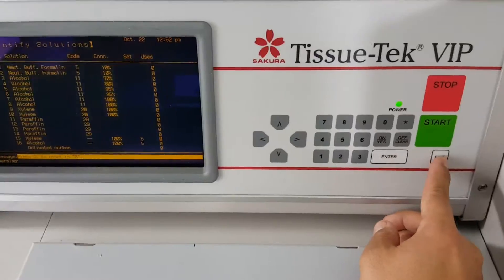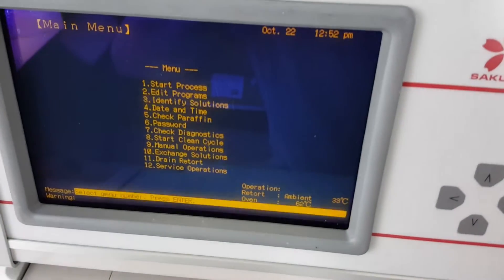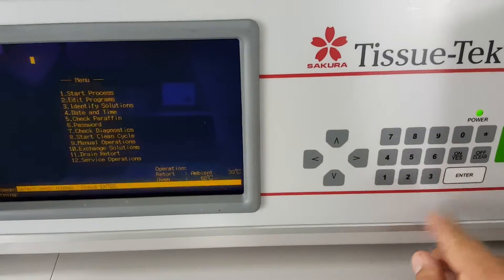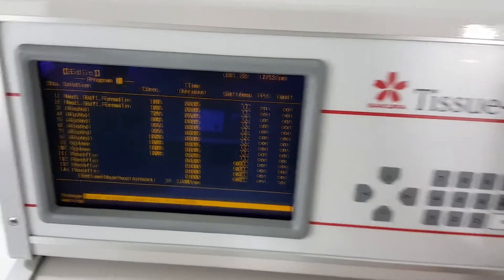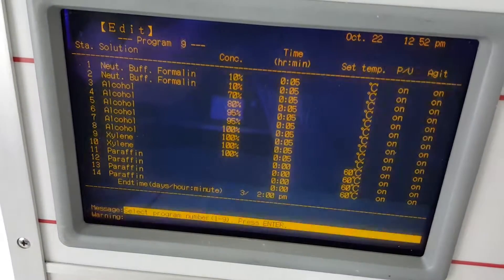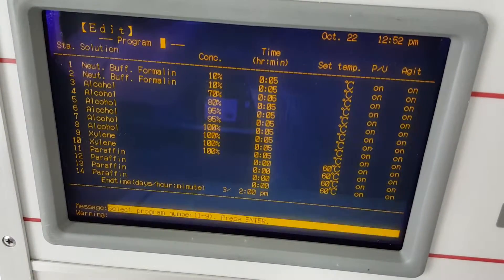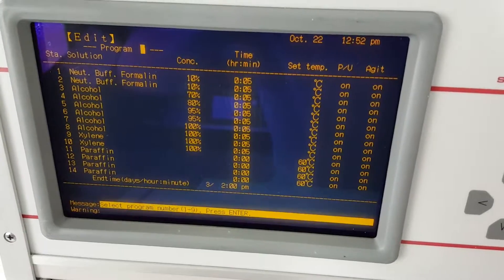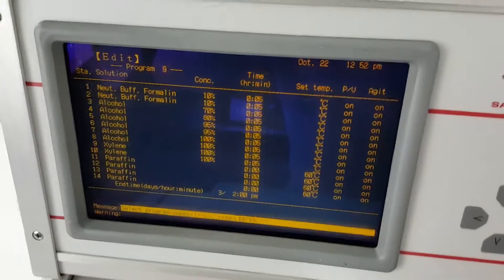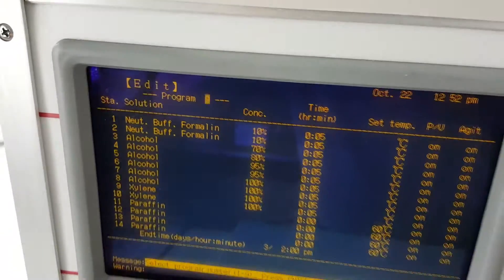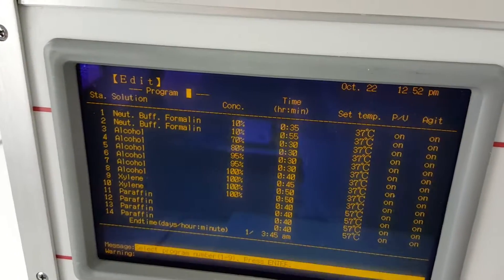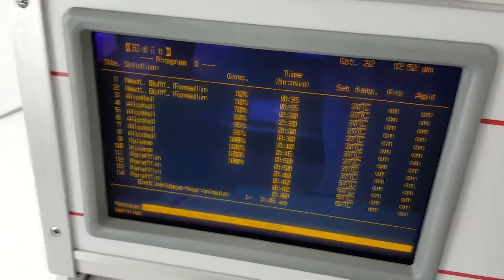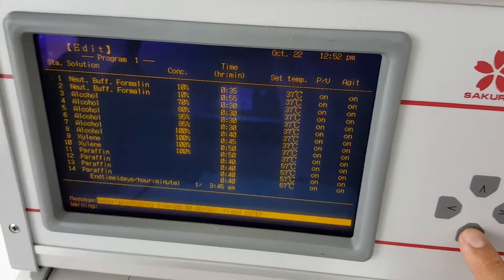I'm going to press exit and get back to my main menu. Then I'm going to edit programs number two. So I'm going to select two, enter. And so as you can see the numbers correspond with the reagents that we just set up in the reagent containers. And so up here where the cursor is flashing you can pick whatever program you want to edit. So if you want to edit program one you just press one and then you can hit the down arrows to edit that program.